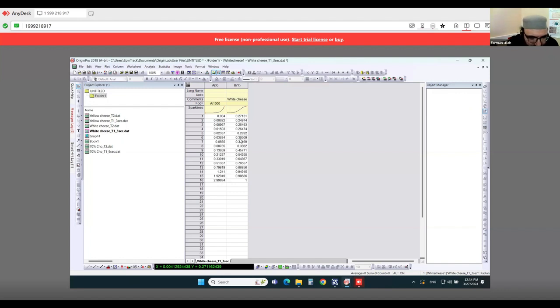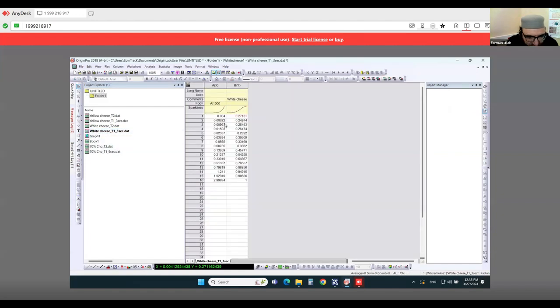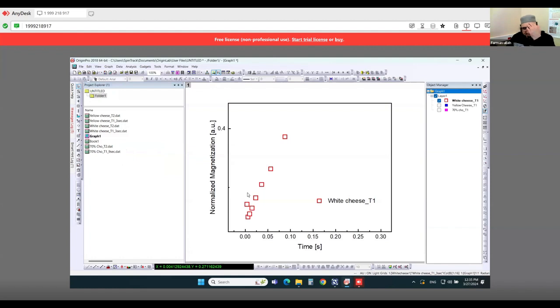Please help me, which one value was that? Sorry, I don't remember. Okay, let's see again, because the first time it's not... No, it's working. Yeah, the problem is that the data is in red and the masking is in red. Okay, so yeah, I got it.